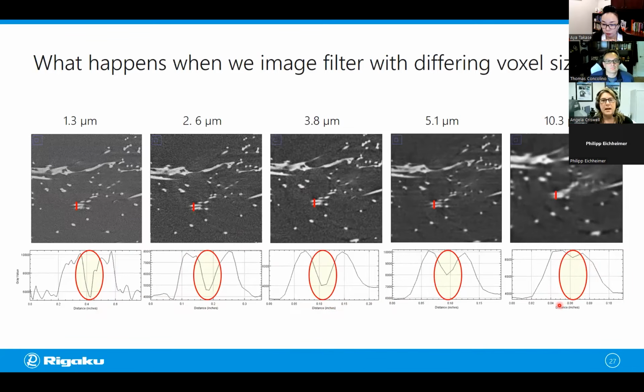And we're actually going to calculate a diameter for that single fiber. That's why these are biased towards larger fiber diameters, on the range of 40 instead of something more correct, from say 16 or 17. So clearly, the smaller bin modes are better in this case. That means we're going to have to collect longer, but we're going to get better resolving power.